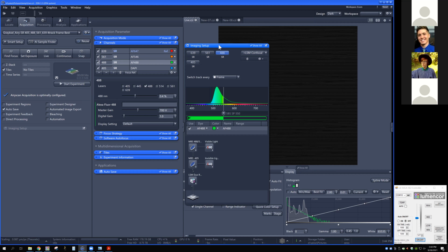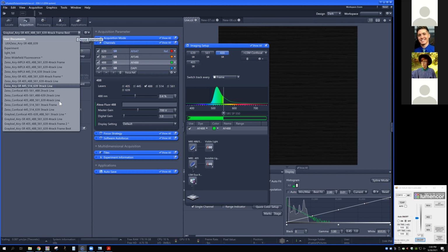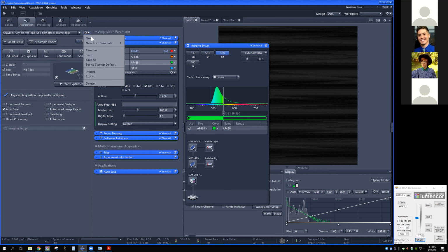Again, this is basically the filter-based hardware setup like you would use for Airy Scan. With the confocal, we showed the option of working with the multiple detectors to get individual channels' worth of information. And I guess the other type of configuration that I should really show you is the spectral imaging that we can do as well. And so for this, I'm just going to create a new one. I don't think that I left you with the spectral configuration, and honestly, I usually don't, but maybe I'll leave one behind just for fun.